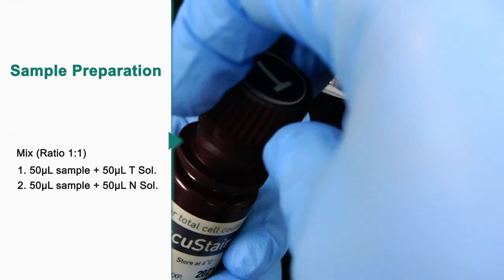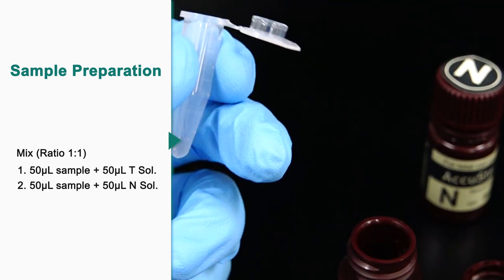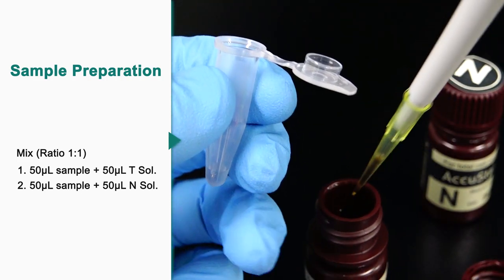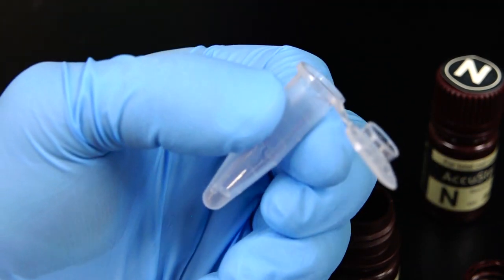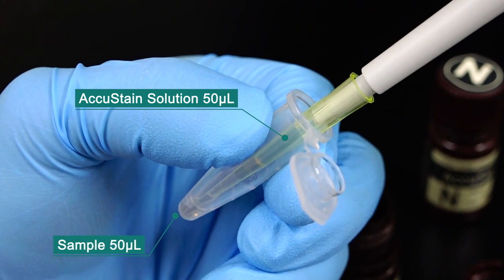Third, sample preparation. There are two types of AccuStane solution. T solution is for total cell and N solution is for non-viable cell. Mix 50μL of the sample with 50μL of T or N AccuStane solution.